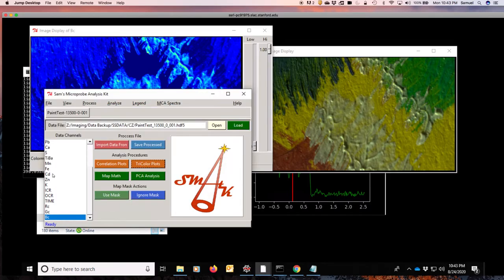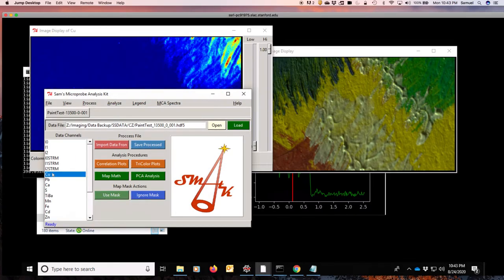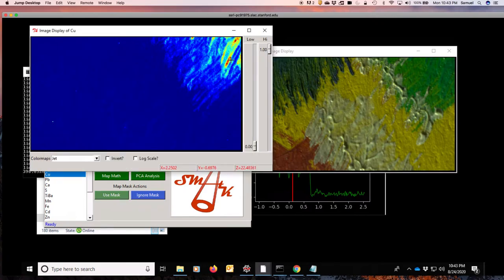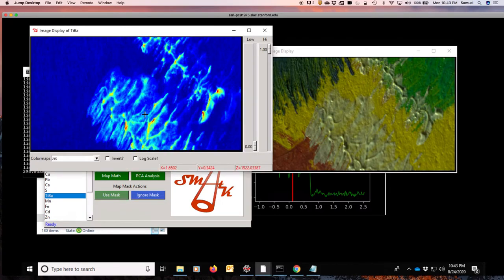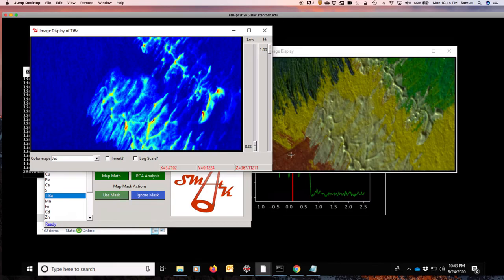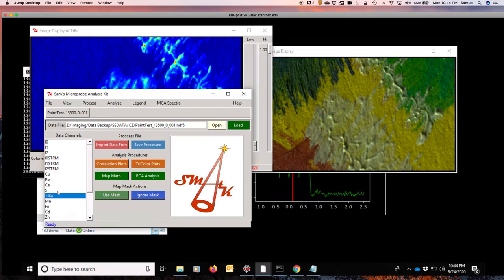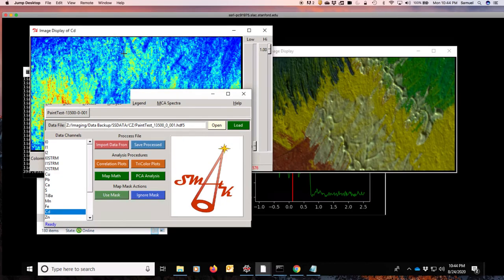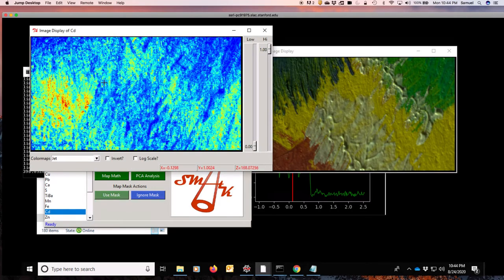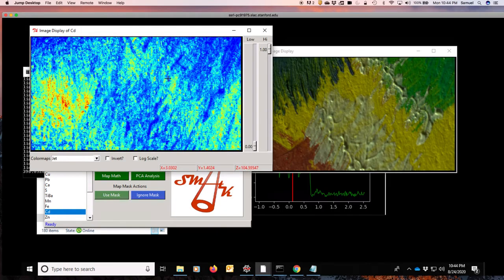So we look at the copper distribution, which matches very well with the green section of paint over here. The titanium bits here match very well with the white bits of paint right there. The red here was an organic lake compound, so it does not have a good compositional signature in the transition metals. And the cadmium there shows up here in these little bits in between in the yellows, cadmium yellow.